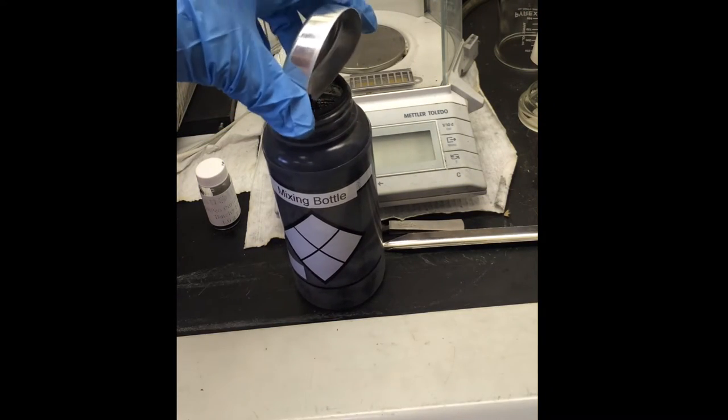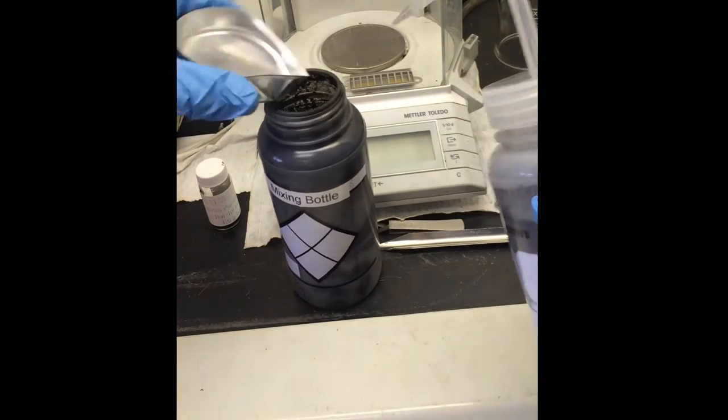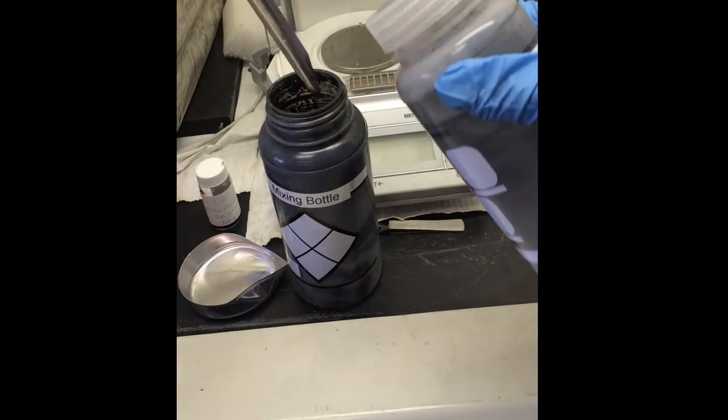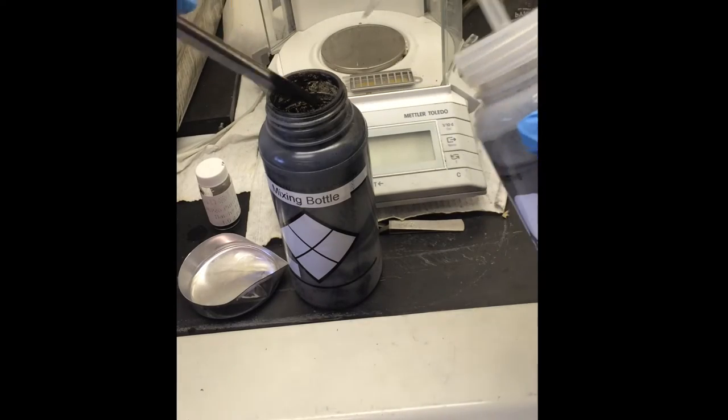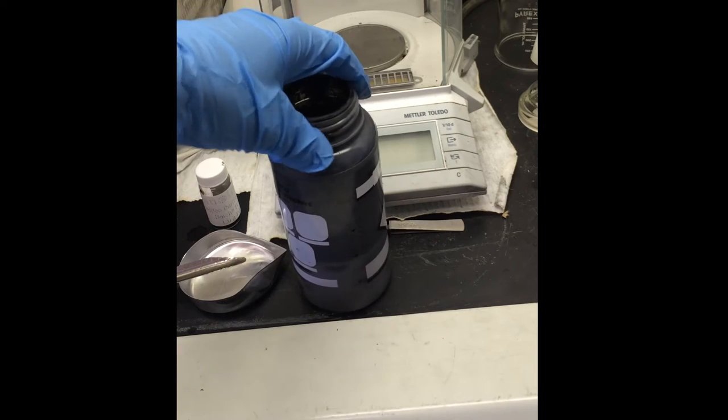Once the usable powder is weighed, the sample is added to a mixing bottle and rinsed with methanol. The methanol shown here is recycled and is reused each time a felt is made. This allows us to use less methanol overall in the process of creating the felts.